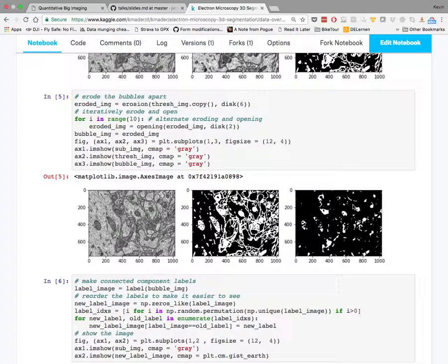And so, if you did enough morphological operations here to get rid of all of these tiny lines, you'd probably damage your cells quite a bit, or damage the shapes of the cells a lot. But if you have that and you then do shape analysis or some of these other things that we covered today, you can easily separate these junk or strange shape fragments from the round cell objects, because you'll have a number of different criteria that you can then apply in order to make that separation.